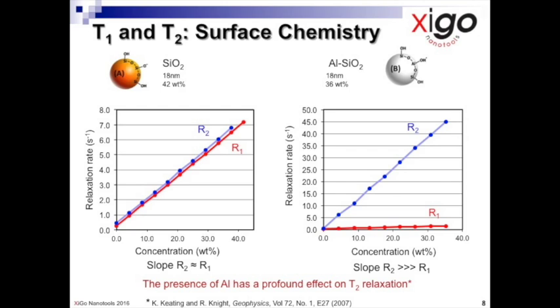Natural aluminosilicate materials, such as clays, are also widely used. They have very diverse crystal chemistry that is critically dependent on the clay's prehistory, and it is well recognized that care must be taken when comparing data on clays from different sources. It is clear, though, that NMR can be used to compare and contrast such materials. This topic will be dealt with in much more detail in a future video.